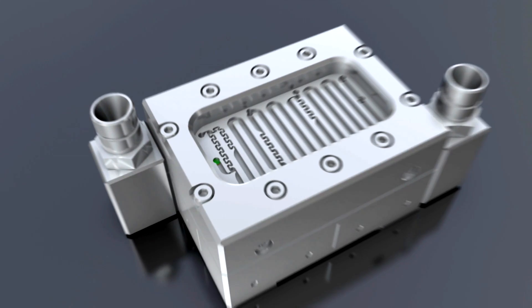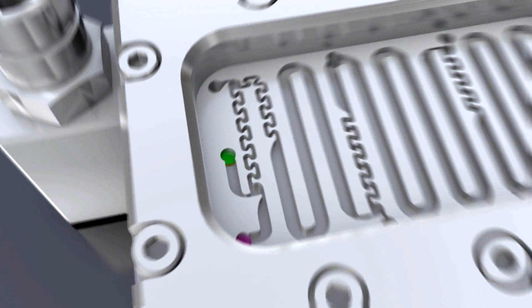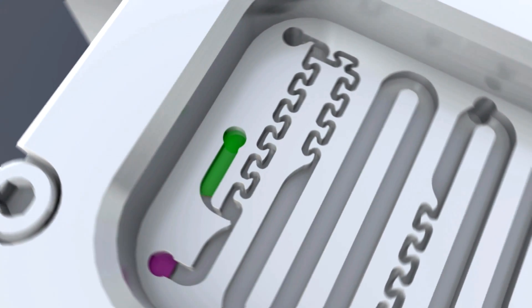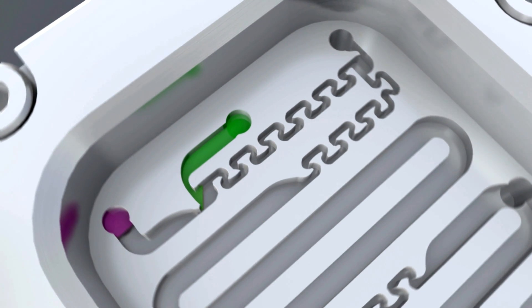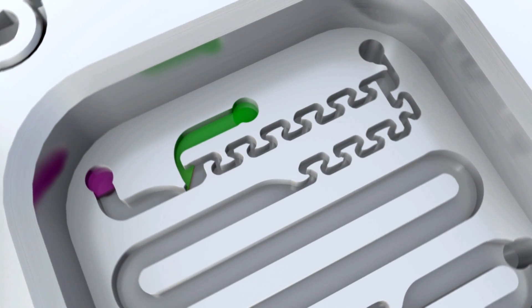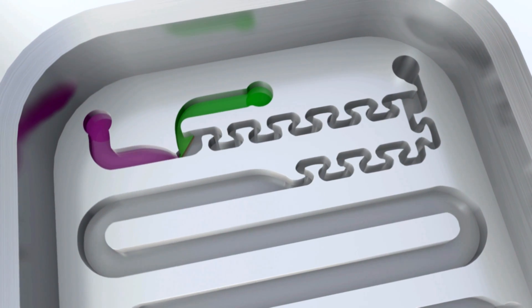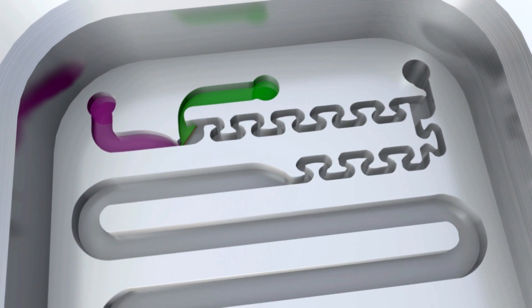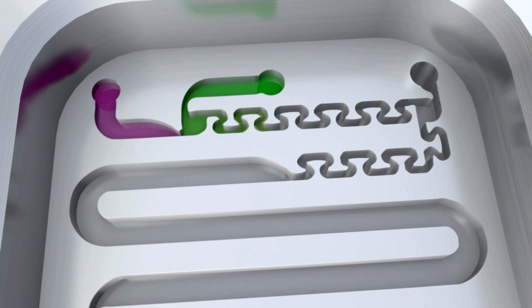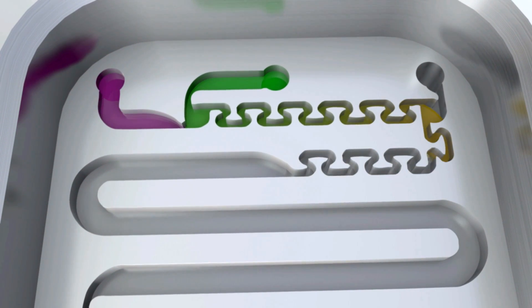The substrate, bromoanisole, flows through the reactor in channels that are only a few millimeters wide. At the same time, the reagent, butylithium, flows into the reactor. Right after the two chemicals are combined, they flow through a meandering structure just a few tenths of a millimeter wide. That leads to a rapid mixing of the two reagents.